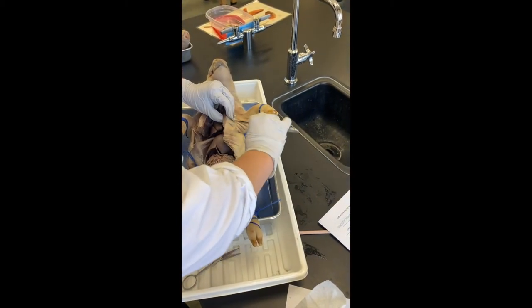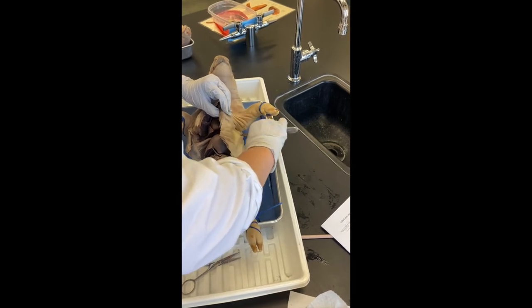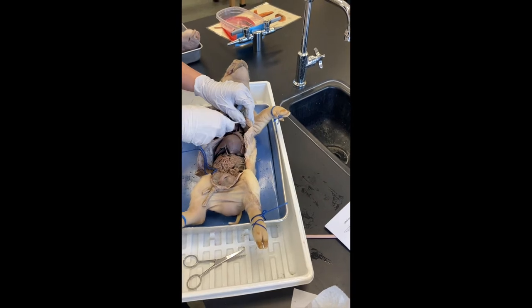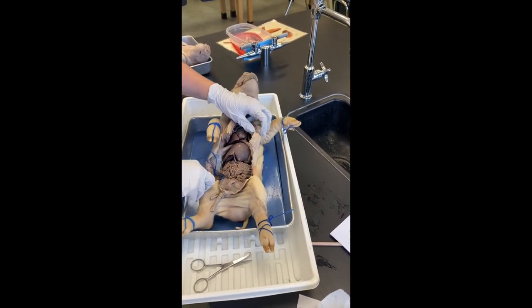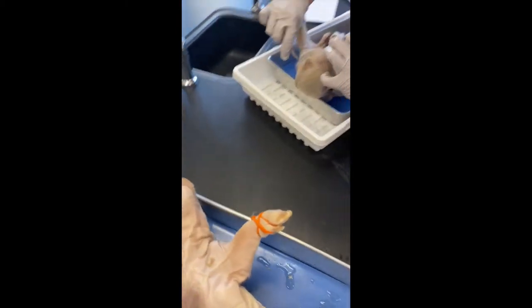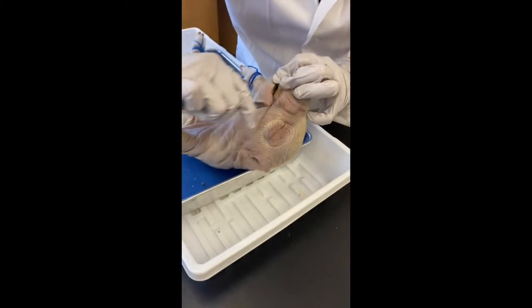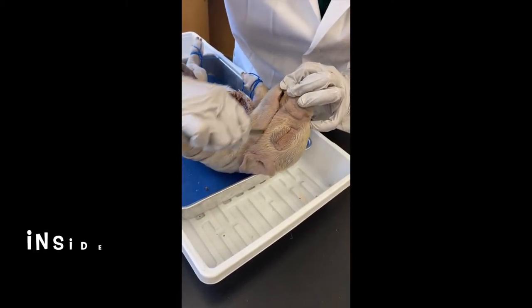So you're just cutting along the, looks like the rib cage there? That's correct. Getting this peeled back. All right, perfect. Oh, I didn't have my blade the right way. There we go. Joker cut. So you're cutting along where the jaw kind of connects right there.